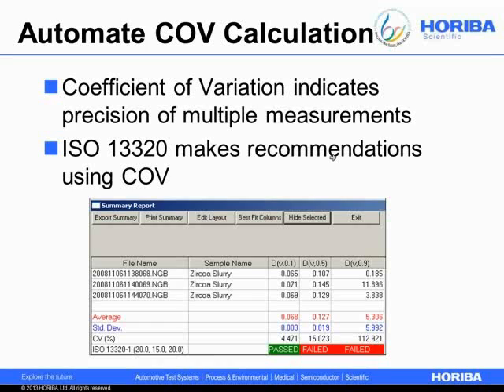You may have a sampling problem that you don't recognize, or a dispersion problem that you don't recognize. A lot of times powders that are shipped, if there is any kind of width to the size distribution, so multiple different sizes, what happens is many times you see the size of the powder, how should I say it to be more clear?